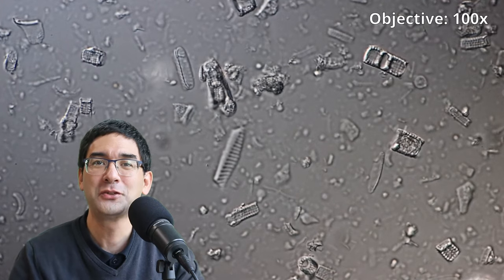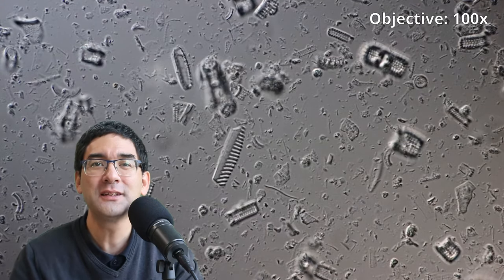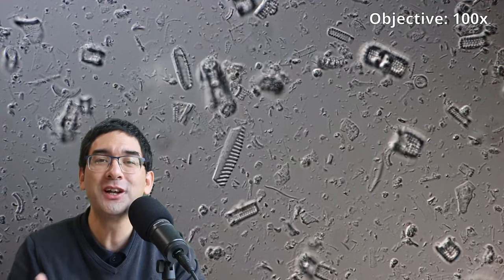So hi, hello and welcome, MicrobeHunter here and today I'd like to look at so-called diatomaceous earth under the microscope.